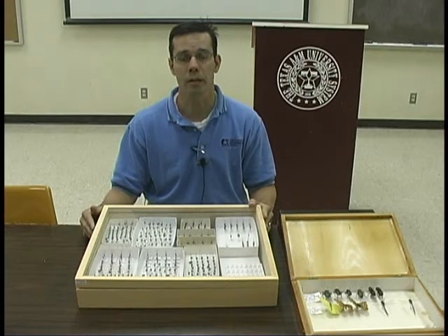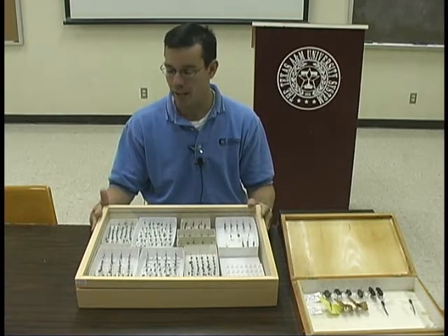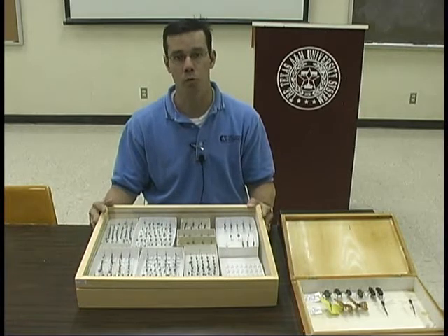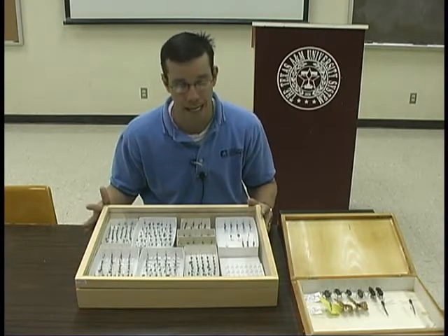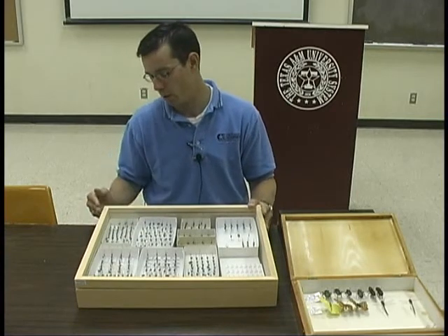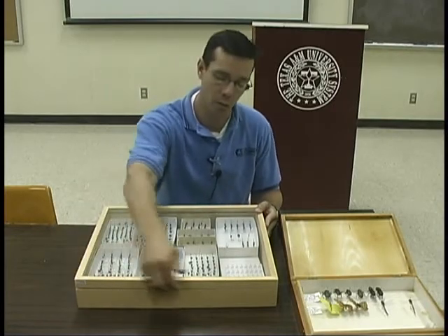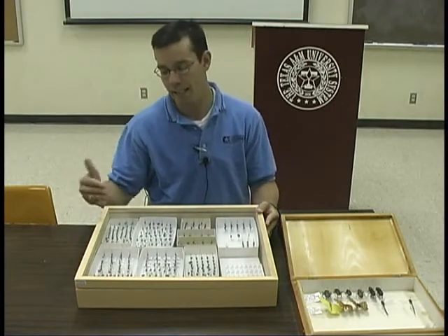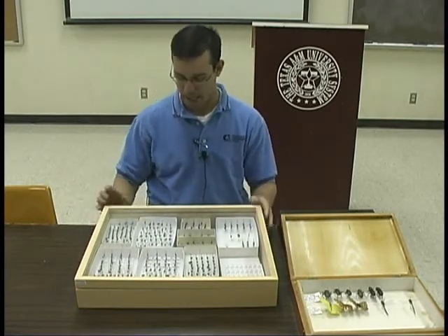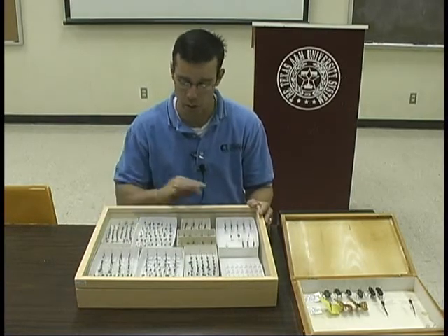Once you've pinned your insects and you're ready to place them somewhere safe and secure, you probably want to locate something called a Cornell drawer. It's the high-end way of preserving insects. It's made of wood and has a glass top. They have a tight seal, which prevents insects from accessing the box, and they have label racks on the front so that you can label your insects and know what's in the drawer.